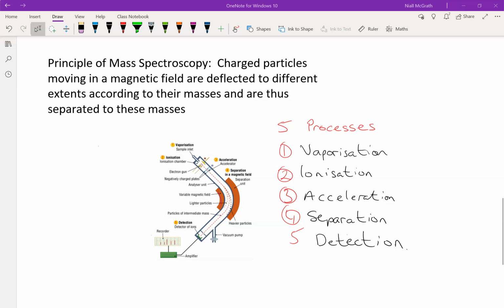So mass spectrometry would be used for drug testing, and for environmental science, for finding isotopes of any elements present, let's say in water samples. It is also similar to gas chromatography that we'll come across later in your course.